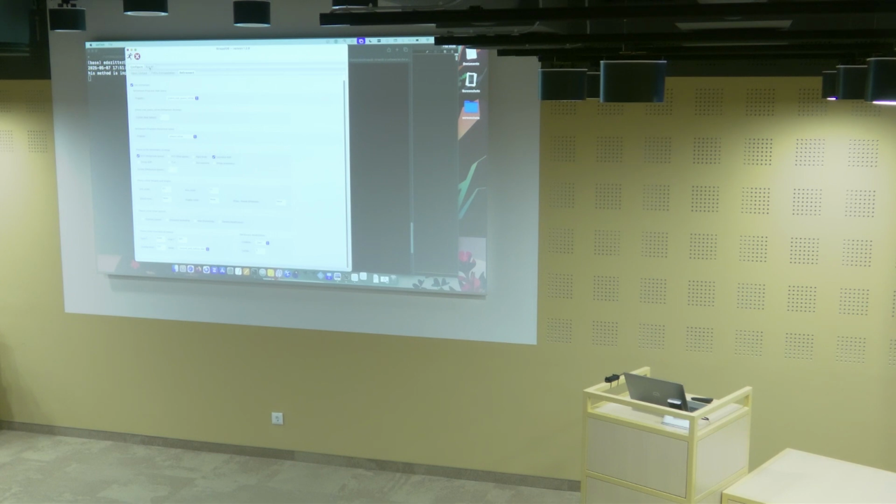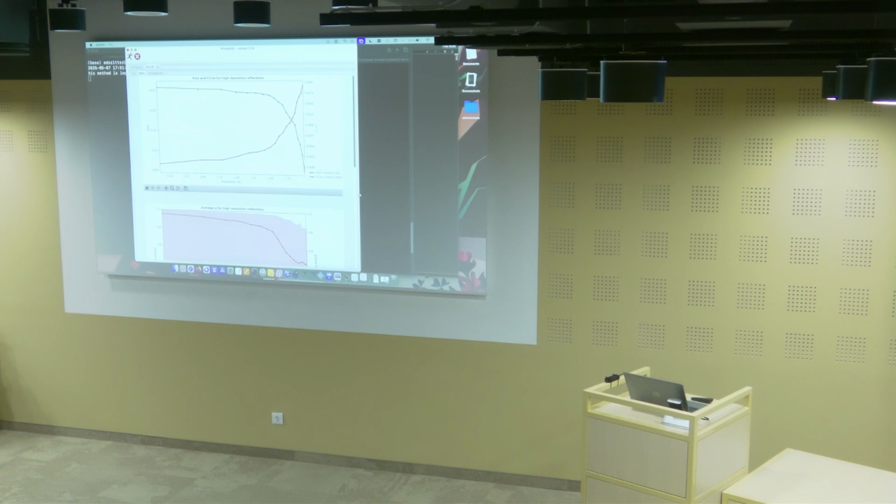With that, another tab will be opening. The first one is the log file, where you can keep track of what's happening. There will be a main tab, which will depict figures. Since these are updated during the run, they kind of disappear, so I hope that doesn't happen too much. There are several figures. I will just pick out a few which are important, and the first one is this one. This contains information on your R iso value and CC iso value.